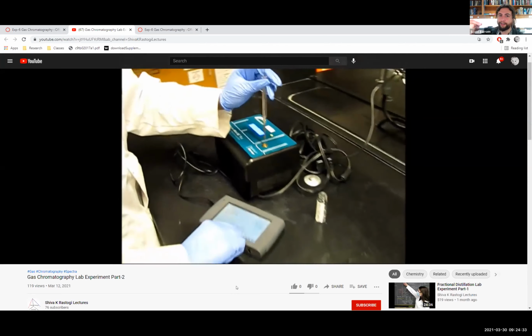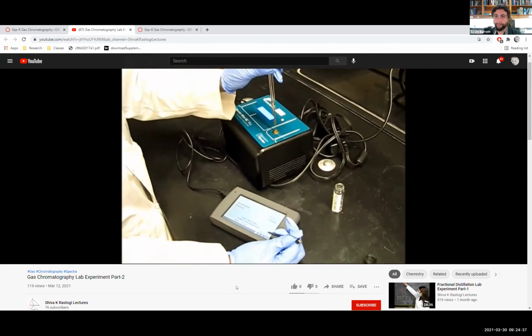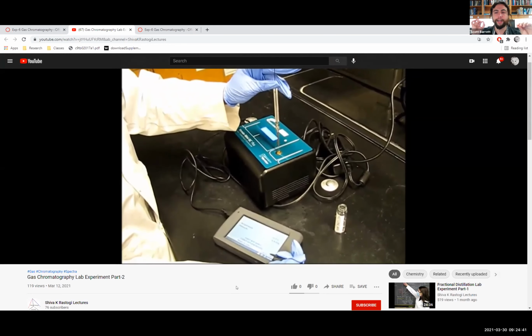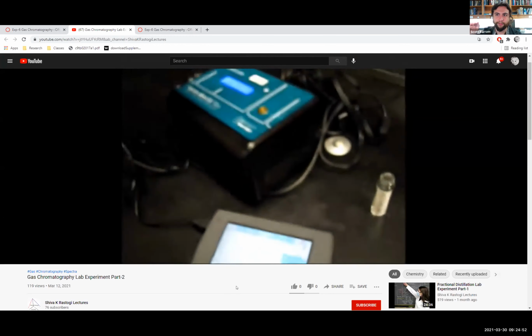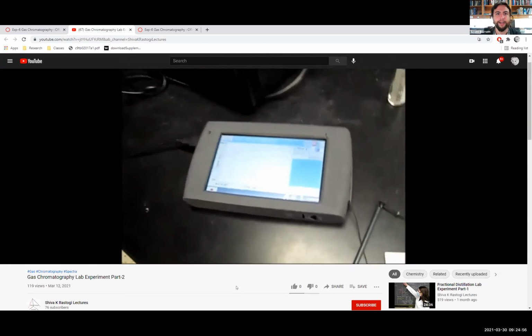So we press it into this plunger, and then we prepare the LabQuest because we're simultaneously going to be plunging the compound into the machine and also hitting collect on the LabQuest. So that way the LabQuest is collecting the data as you're putting the compound directly into the machine. You get a stabilized time of exactly knowing when it entered, and then they have placed the compound into the machine and it started to run.